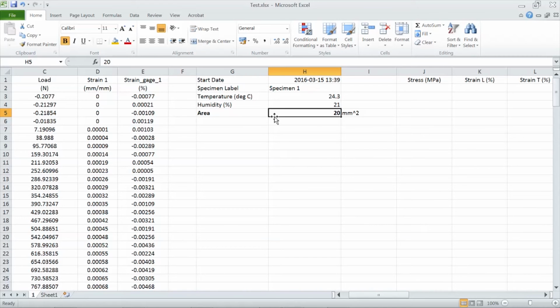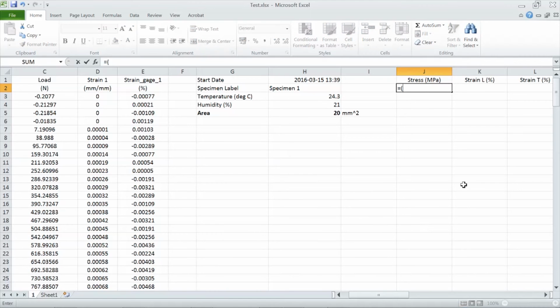But what about that shift I was talking about? Okay, let's do it with a shift right away. If I wouldn't have to shift values, I would just divide this by cross-section area and I am done. But I have to shift it. So first of all, the shift will look like this. Remember I said that this point now is a new 0 value. I take this C6 value, and I have to subtract the same value from all values in this column.